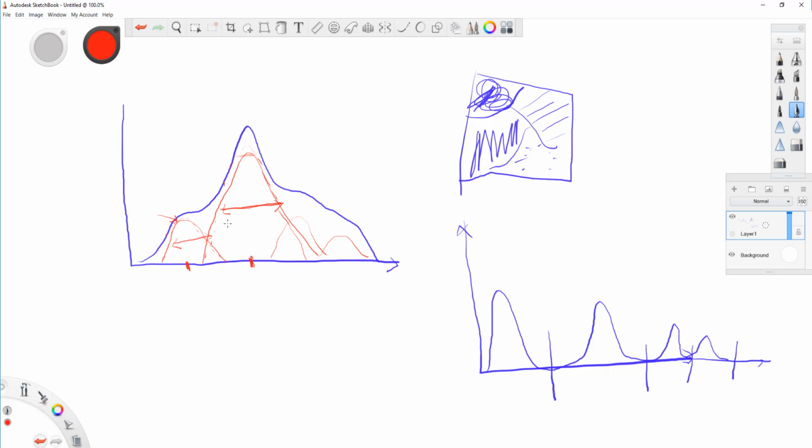What parameters? I just mentioned these three parameters. Think of this as k-means, except we introduce this variance term. If you remember, in k-means we are doing hard assignments, right? If you have a cluster right here, with C1 center right here and C2 center right here, this point corresponds to C2. That's it, because it's closer to C2. This one corresponds to C2, and this one corresponds to C1. These are hard assignments of each data point.